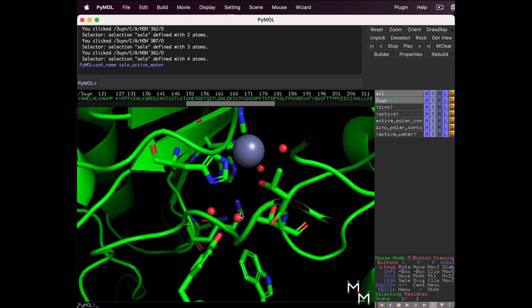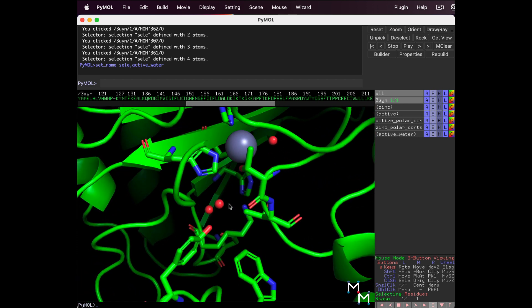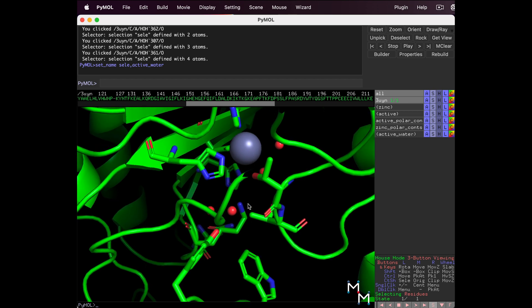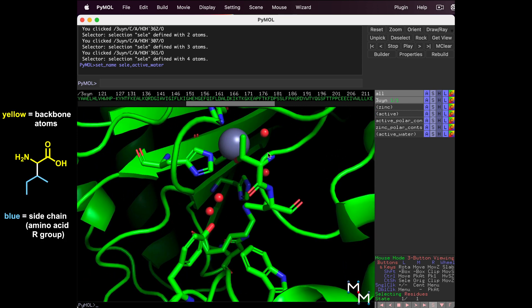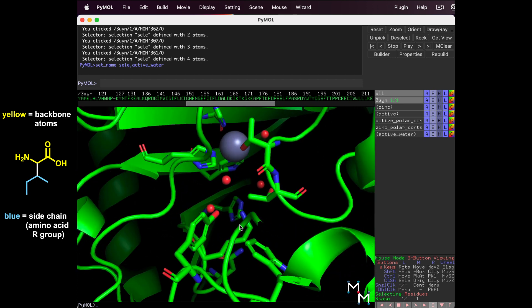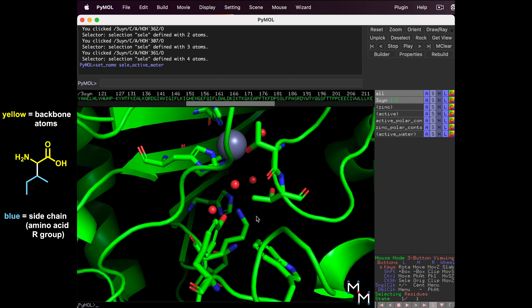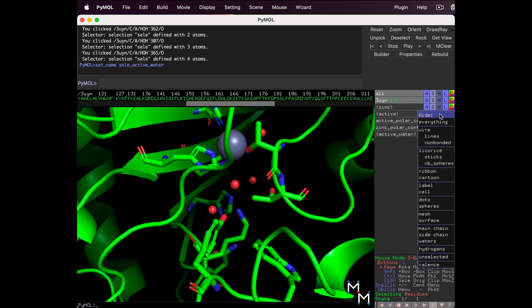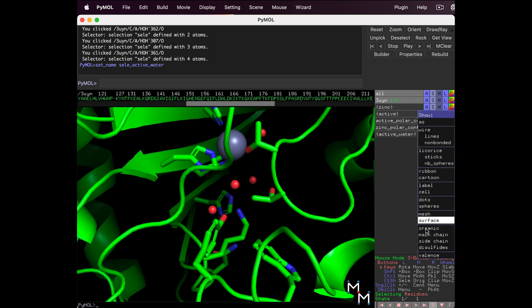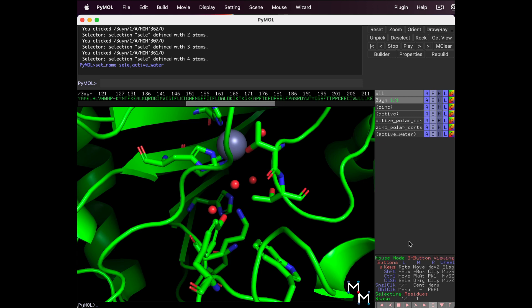When we display amino acids as sticks, PyMol shows the atoms that make up both the backbone and sidechain. The backbone atoms connect the groups that form new covalent bonds when the protein is made, and the sidechain is the variable group, the R group on that specific amino acid. We can show or hide each of these separately. So next to Active, select H, Main Chain. That hides the backbone. To add it back in, show Main Chain sticks. We've done a ton of work.